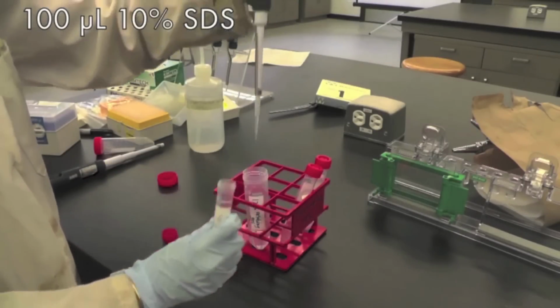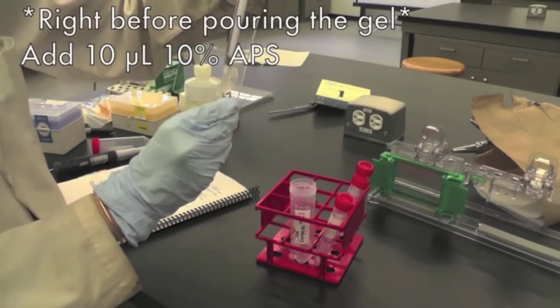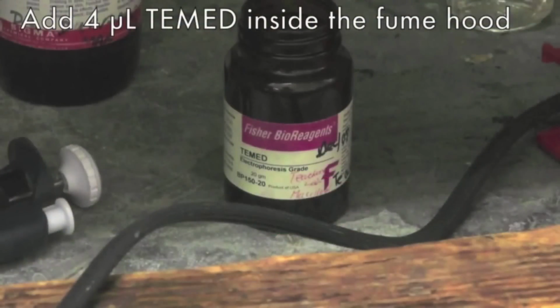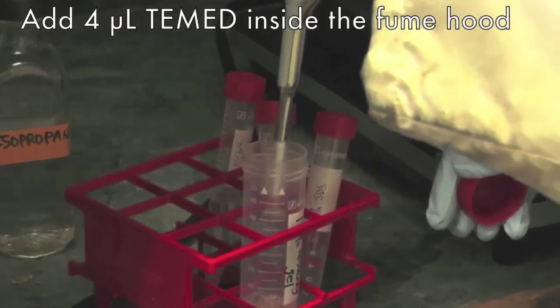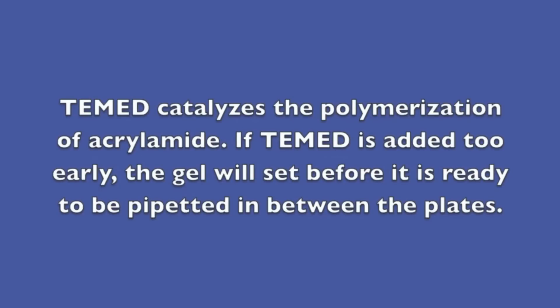Right before you're ready to pour the gel, add 10μL of 10% APS and 4μL of TEMED. Please note that TEMED has to be added in the fume hood due to its strong odor. TEMED catalyzes the polymerization of acrylamide. If TEMED is added way too early, the gel will set before it's ready to be pipetted in between the plates.